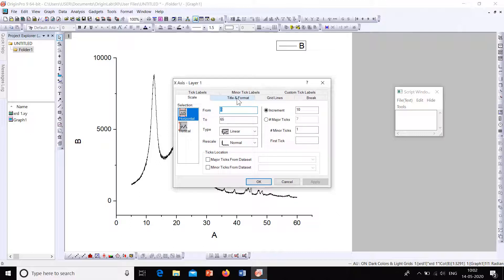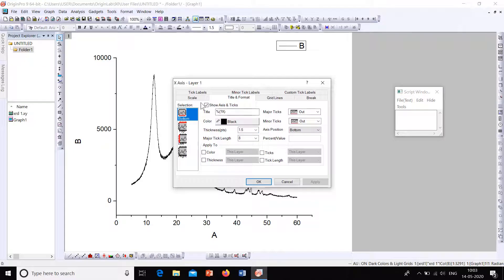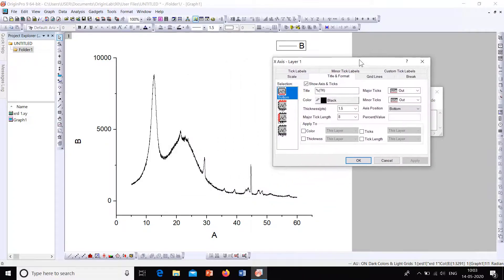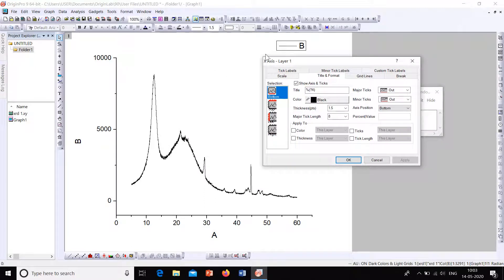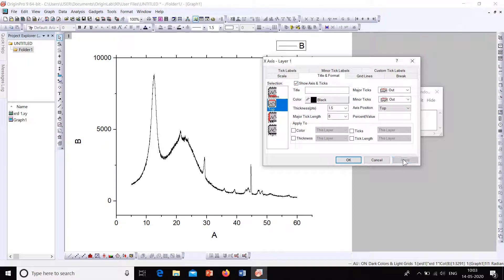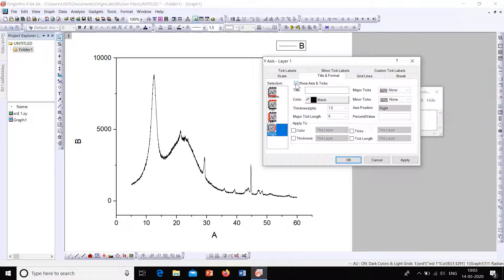From this dialog box, first select the Title and Format option. To close the box at the top, select 'Top', then go to 'Show Axis and Ticks' and apply. You'll see the axis at the top. To remove the ticks, set Major Ticks and Minor Ticks to None and apply. Then go to Right, show axis and ticks — None is already selected — and apply. The box is now closed.